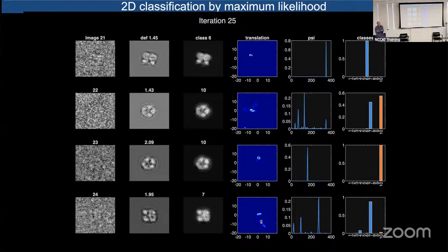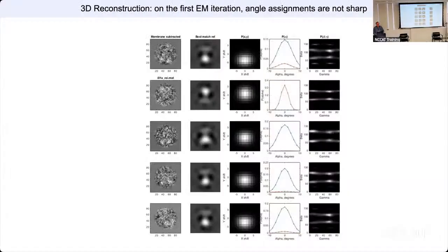But what we do is we say, I have this data set of 100,000 particle images, and I want to see roughly what views of the particle I've got, and so maybe I will sort them into 100 classes or 30 classes, knowing that the smaller the class numbers, the more there's going to be blurring from combining particles with slightly different views.